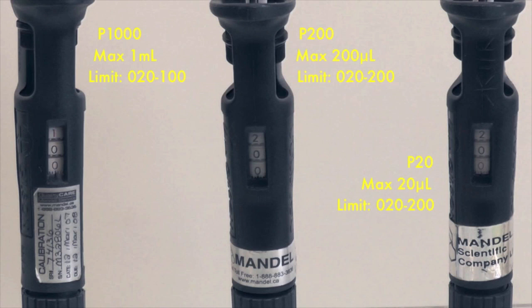You should never go over the limit as this will damage the pipetment. The range of a P1000 is between 200 microliters to 1000 microliters, represented by 020 to 100 on the dial.